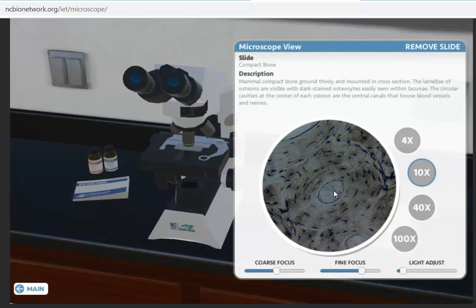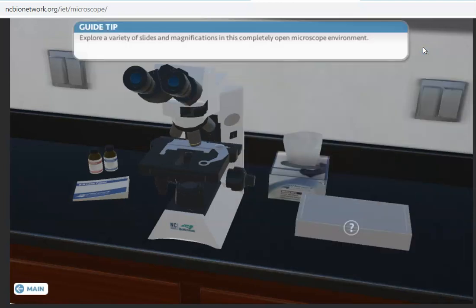Now, if we were in class, you would do those drawings and turn them in, and I would record them and hand them back to you, so you'll just electronically submit your drawings, and away we'll go with that. I'll get your grade in the grade book, and life will go on wonderfully. So that's kind of the process to use this virtual scope. The learning curve's probably a little shorter because you're not as intimidated by this scope than you would be by a real thing in front of you in a classroom in front of other students. But hopefully this little tutorial here gives you an idea of sort of what we're looking for there.